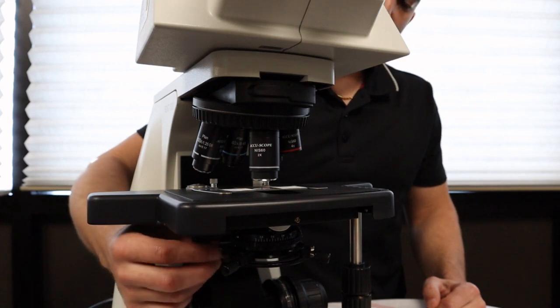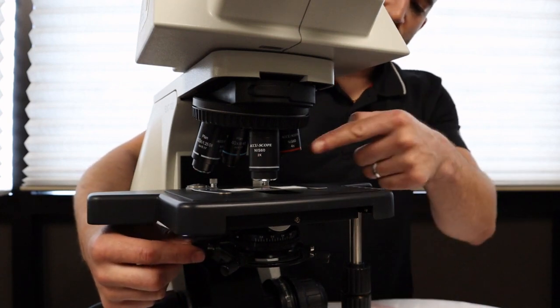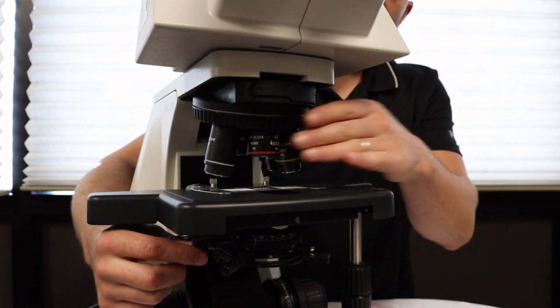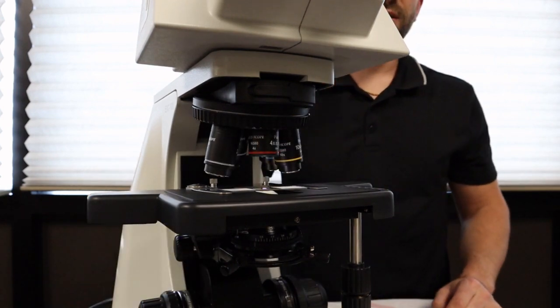This demonstrates a flip-in, flip-out condenser. When you're using the 2x objective, you'll have the condenser lens flipped out, and then when you move to the other objectives, you flip it in place.